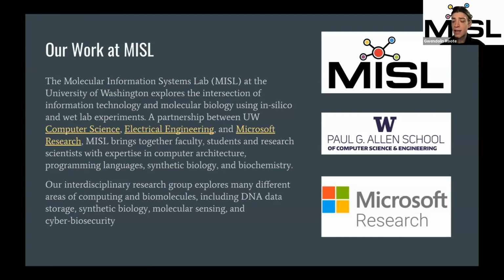Sometimes that line is kind of blurred at the Molecular Information Systems Lab because we store data in samples for the most part. So having a robust connection between physical objects and the computer is very important to us. And so we were searching for a tool that made that really easy and robust connection in order to help our research.